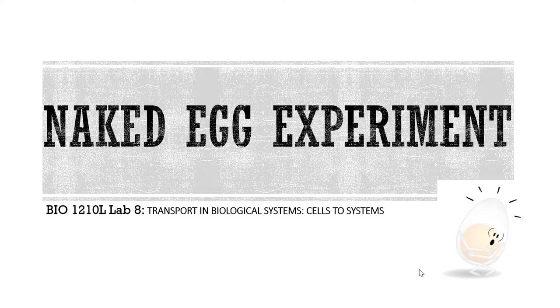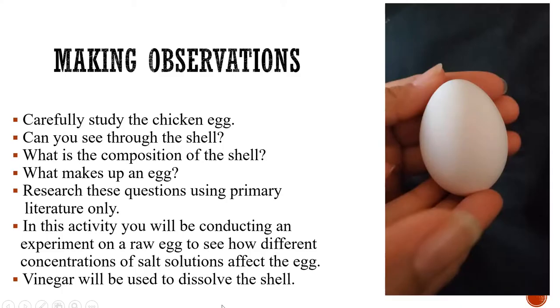Naked egg experiment. This is part of Lab 8 for Bio 1210. Making observations. You first want to carefully study the chicken egg.